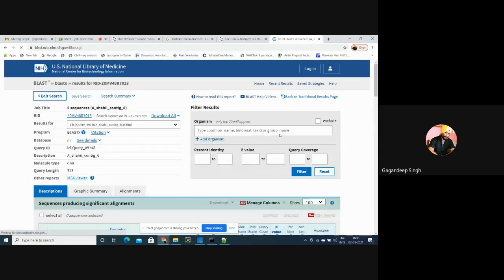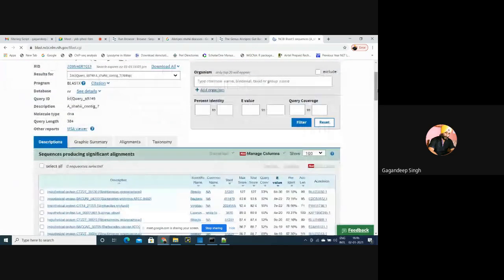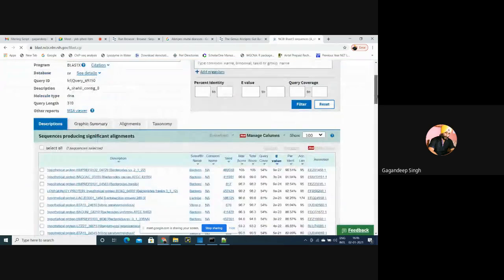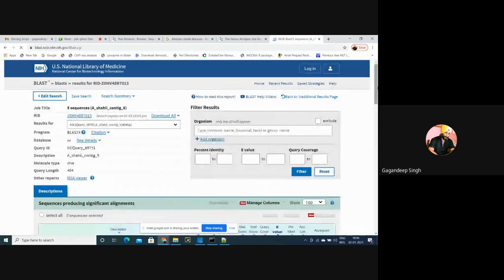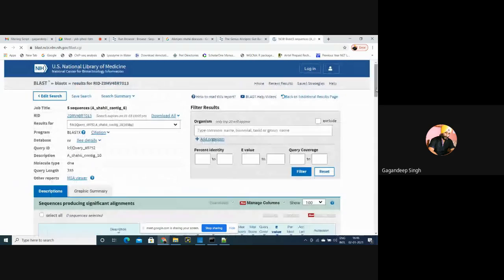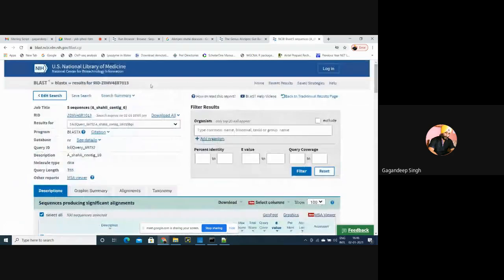Okay, now in this scenario, what is the sixth sequence? This is also hypothetical. Second, again hypothetical. Don't be afraid of these hypothetical proteins, because from hypothetical proteins you can generate very good information. I have published a lot of papers from hypothetical proteins only. I have selected very little data, due to which everything is hypothetical in this case. No problem. I'll target the next 10.